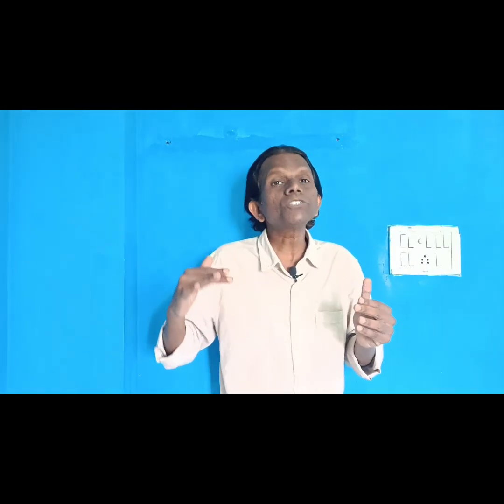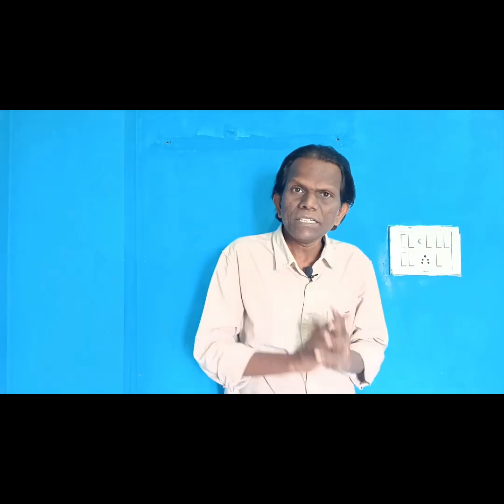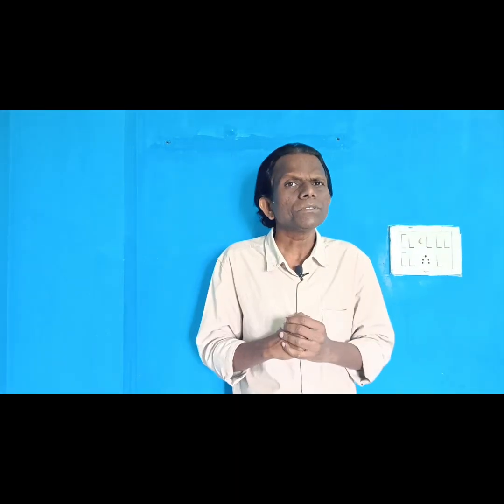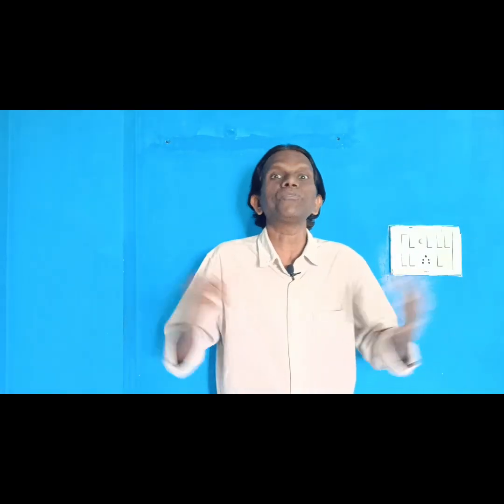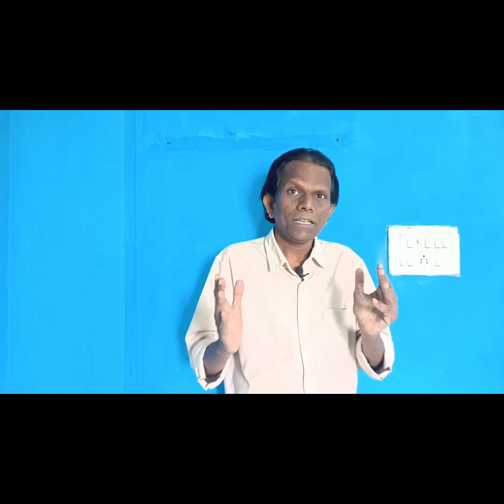Whereas at 30 degrees centigrade, which is nothing but room temperature, we can know the count of not only aerobic mesophiles but, in addition, some spoilage bacteria and some psychrotrophs also. Psychrotrophs, is it the same word as psychrophiles? We heard about psychrophiles: from 0 to 20 degrees centigrade, with optimum temperature 12 to 15 degrees centigrade. But what are psychrotrophs? Yes.